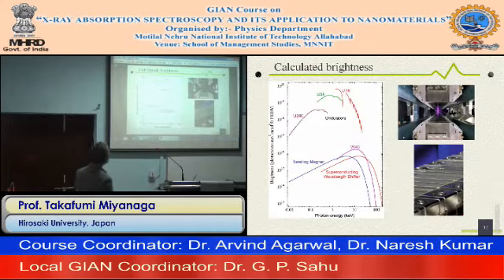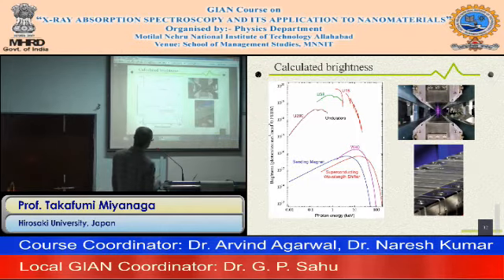Now we summarize: the bending magnet is here, some wigglers are here, and the undulator is like that. This is an example of the ESRF in France. Here is a photo in front of the wiggler and its undulator. The electron is coming from the backside.